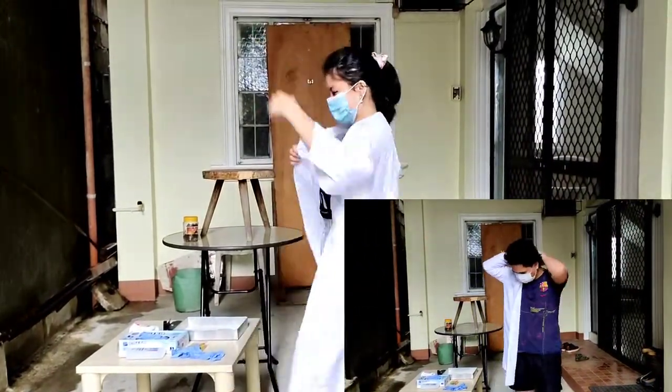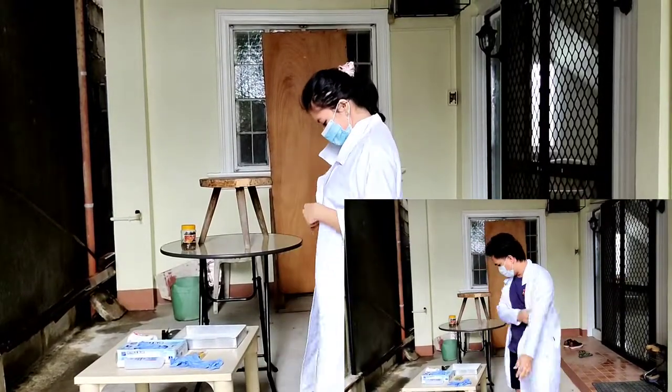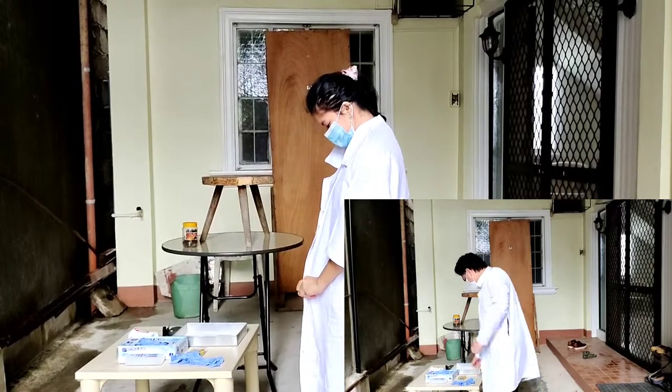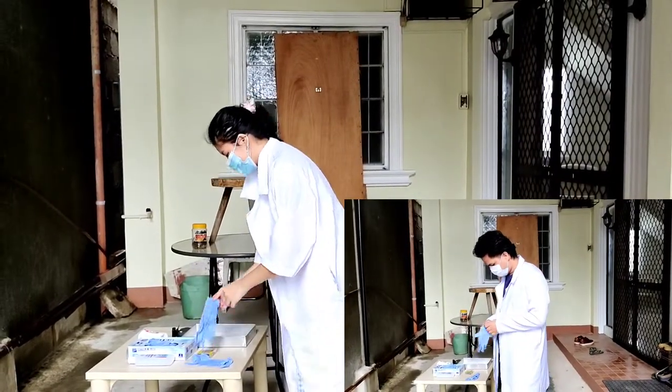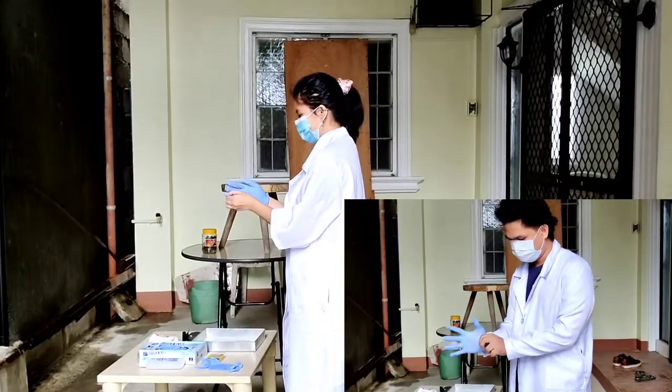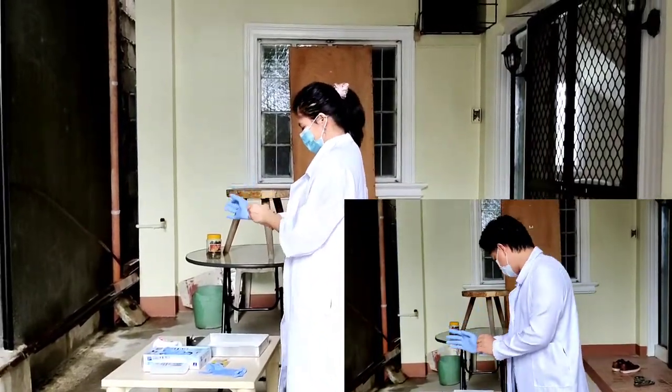Before we begin with our experiment, it is a must to have done personal protective equipment, such as lab gowns, surgical gloves, and surgical masks. It is advisable to keep long hair in a neat hairstyle, like a ponytail or a tight bun.